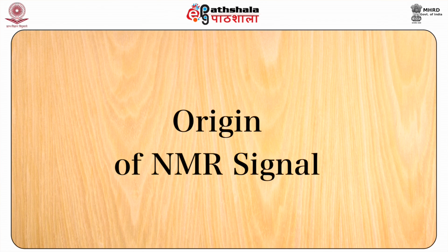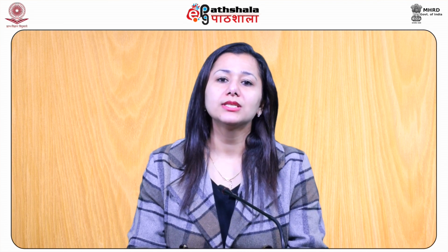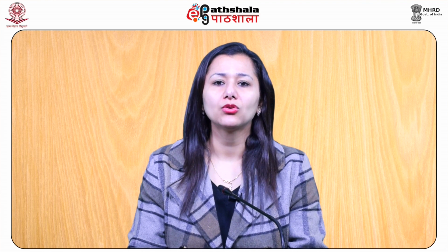Now we shall study the origin of the NMR signal. First we shall see the Zeeman effect. It was discovered in the 1890s that when inserted in a magnetic field B0, nuclei that possess spin align themselves according to their energy states.